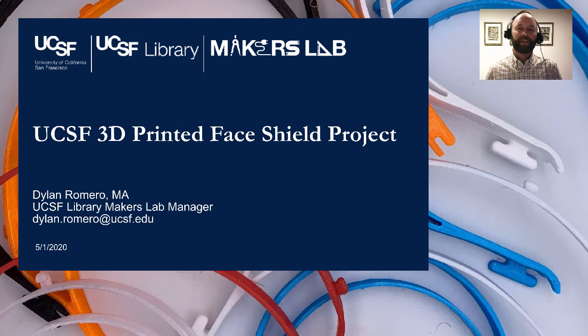Hello, my name is Dylan Romero, and I work in the UCSF Library's Makers Lab. I'm here with you today to talk about the UCSF 3D printed face shield project. During this presentation, we'll provide an overview of the manufacturing process for the face shields. This information can be replicated at your institution if you are in need of face shields.